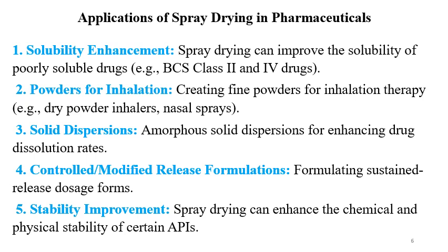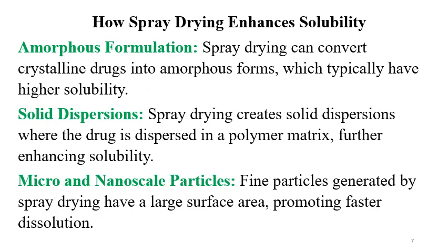Controlled release formulation, modified release formulations can be made by spray drying technique. Stability improvement can be done. Spray drying can enhance the chemical and physical stability of certain APIs. Some of the APIs can be stabilized by spray drying. So now here is to understand that the most important aspect of solubility enhancement by spray drying.